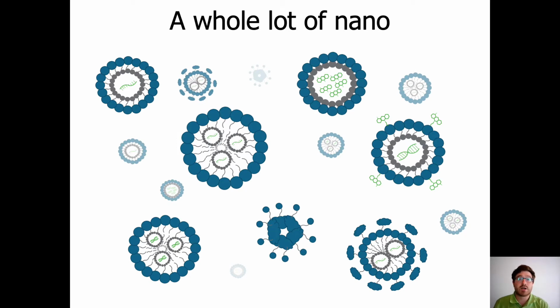Nanoparticles are booming, and they come in a lot of different forms. Liposomes, lipid nanoparticles, solid lipid nanoparticles, lipid nanoemulsions, polymeric nanocarriers, and many, many more. Particles with their own unique tweak and proprietary content for many different applications. In gene therapy, for example, cancer treatment, vaccine development, and other biopharma. One of the reasons for this abundance of options is the fact that a variety of payloads can be encapsulated. Of course, making nanoparticles an option in a lot of areas.